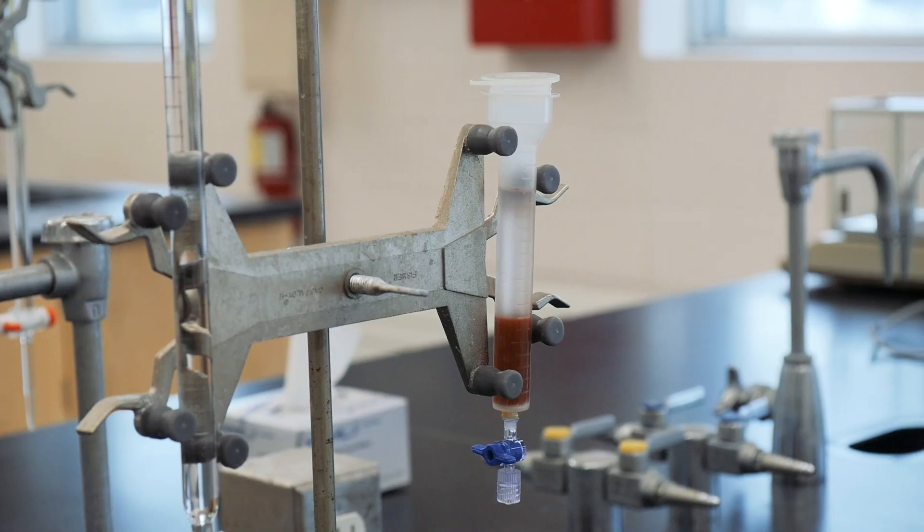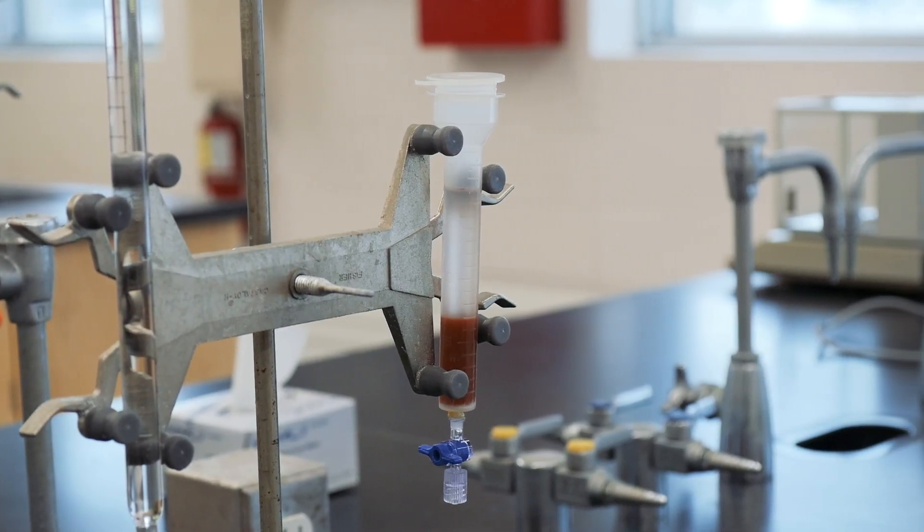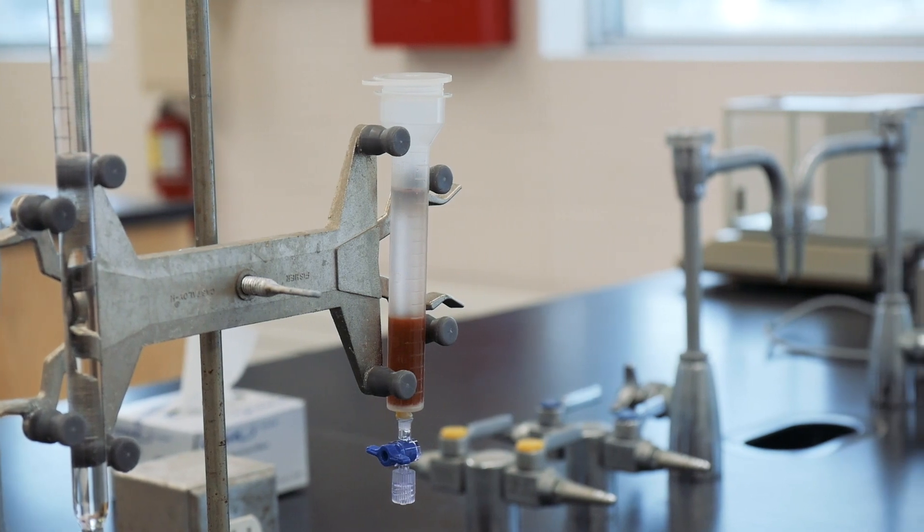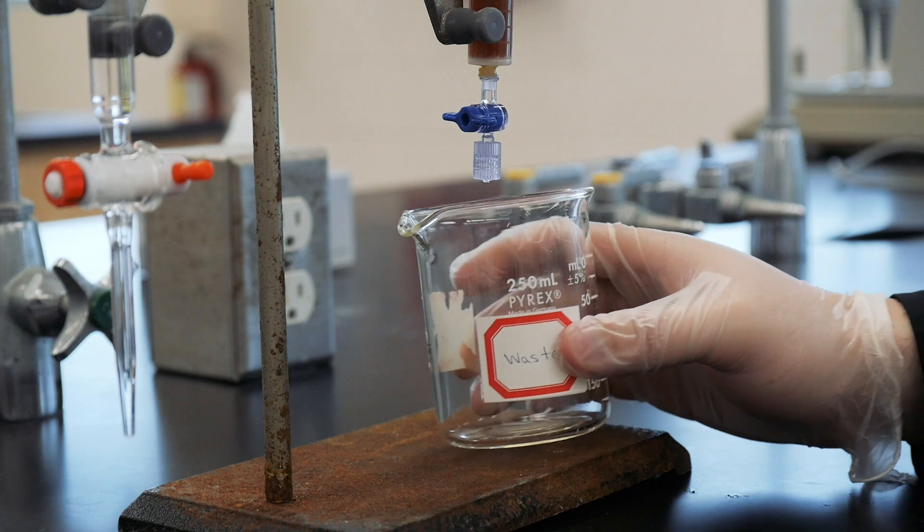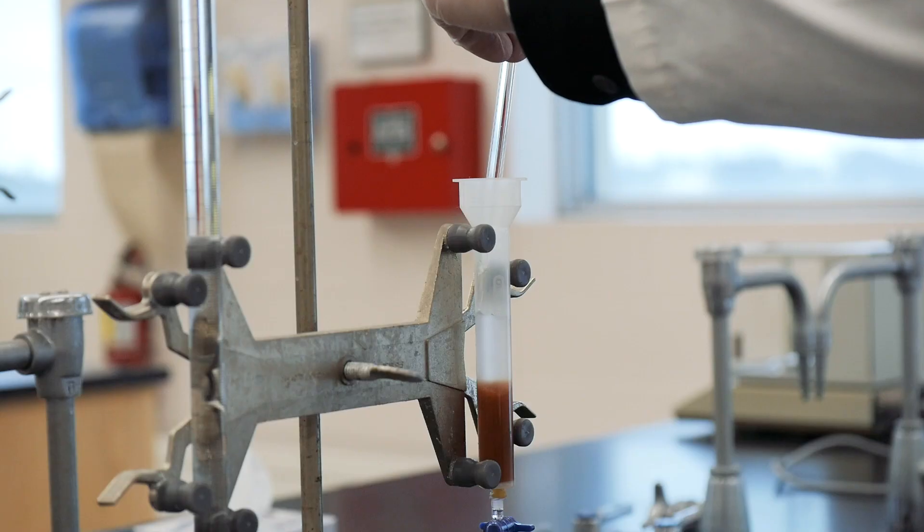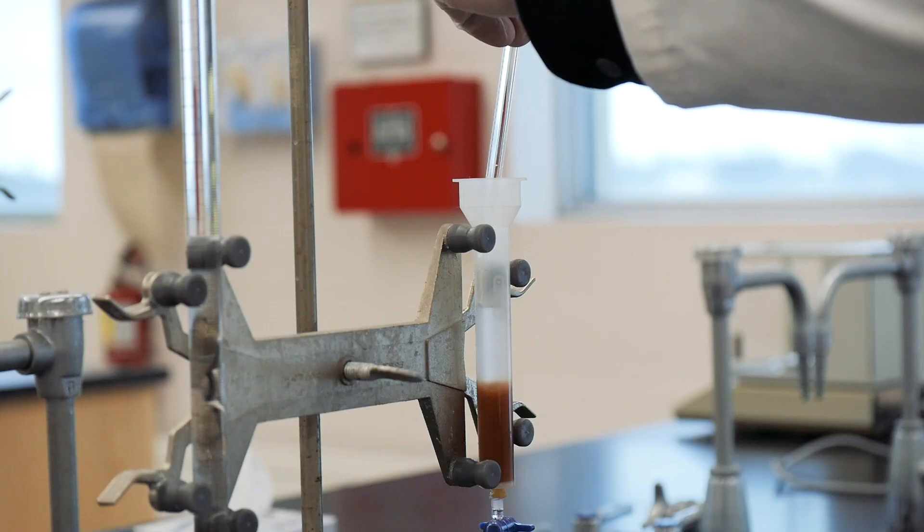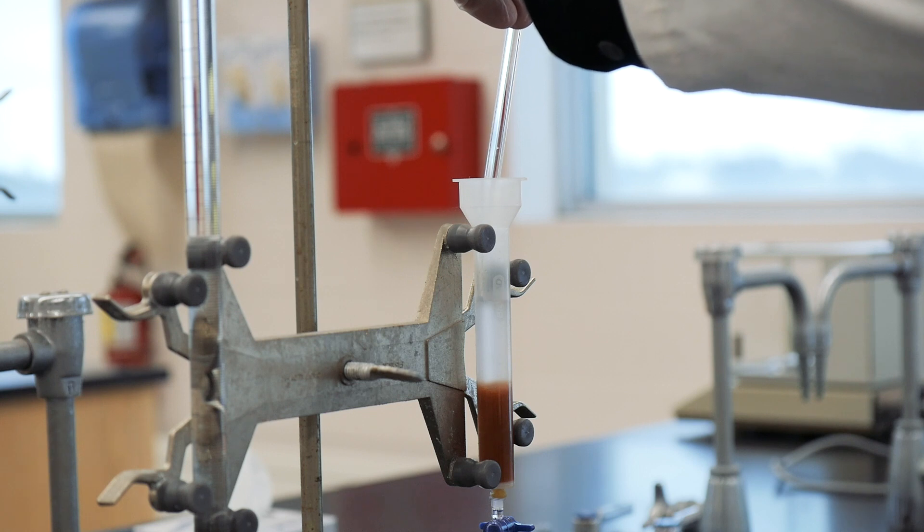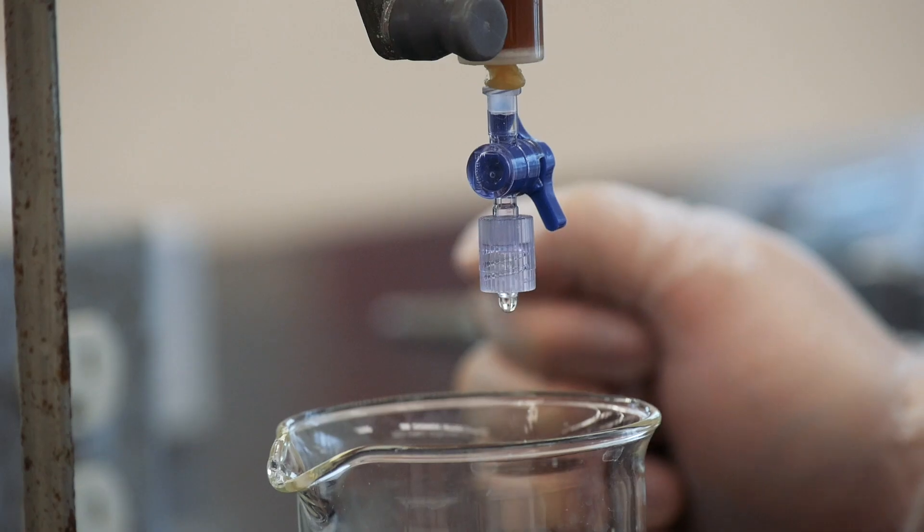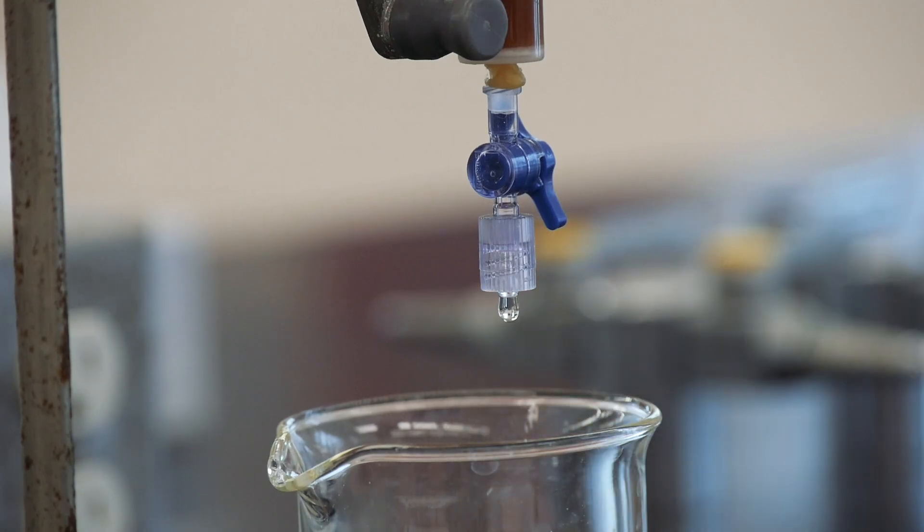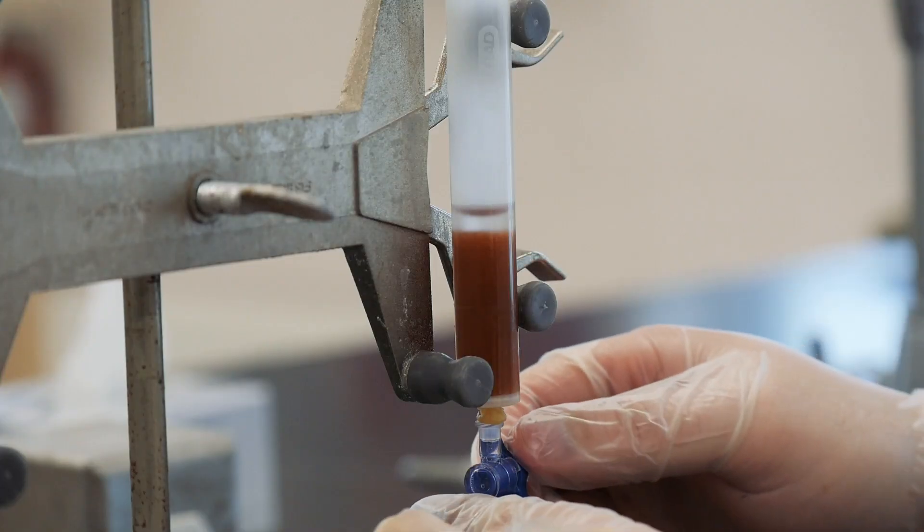An ion exchange column should already be available and attached to your stand using a burette clamp. Remove the cover from the column, place a 250 mil beaker underneath the column, and gently pour about 10 mils of 4 molar hydrochloric acid onto the column to activate the ion exchange resin. Allow the solution to run slowly onto the column at a rate of about one drop per second, allowing the liquid level to drop just above the level of the resin.